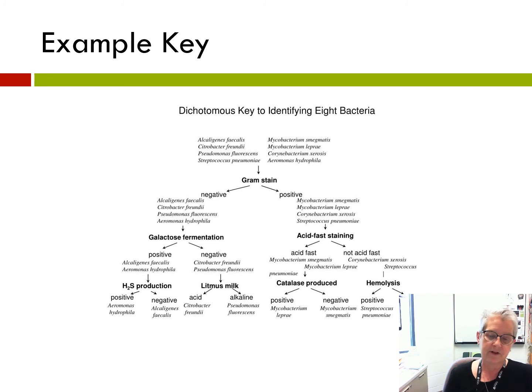Here's a sample of a dichotomous key from the internet where the bacteria are listed in each step. I find this to be the most helpful in keeping track of the 13 bacteria. So in comparison to the dichotomous key I showed earlier in this presentation, where the names weren't listed until they were identified, this one I think helps you to keep track. So if you list all of the bacteria, dropping them out along the way, then you will be sure that you have identified all 13.